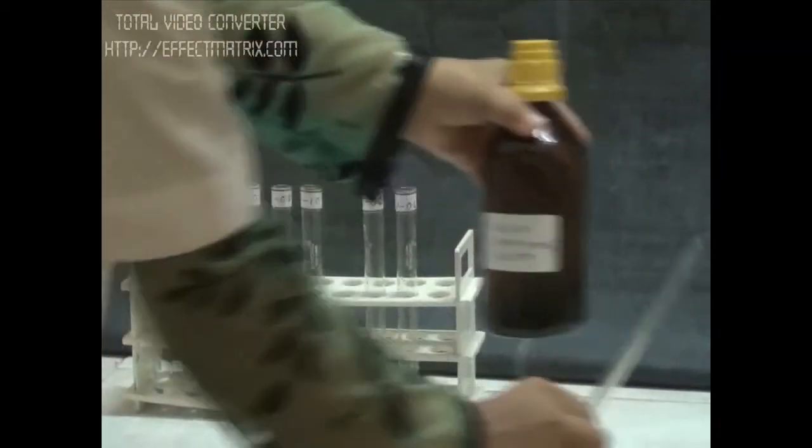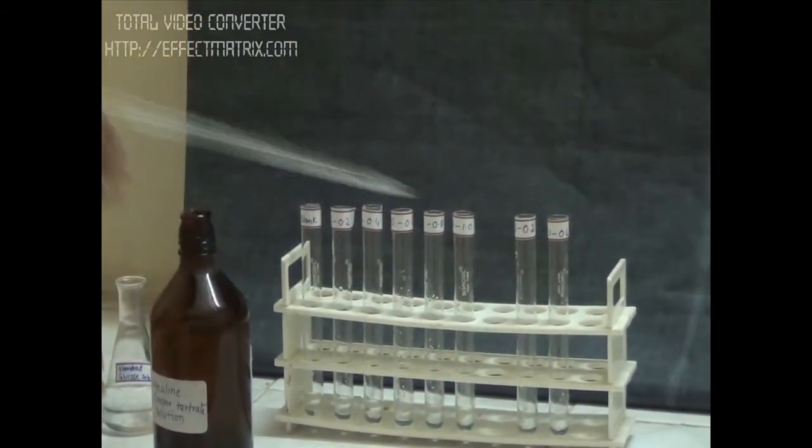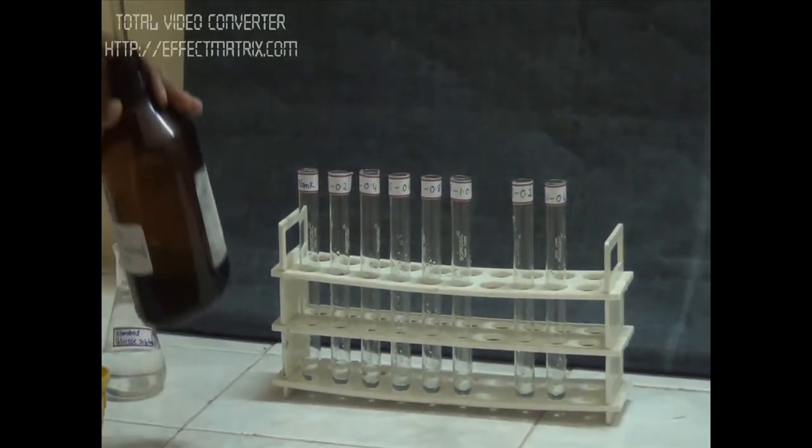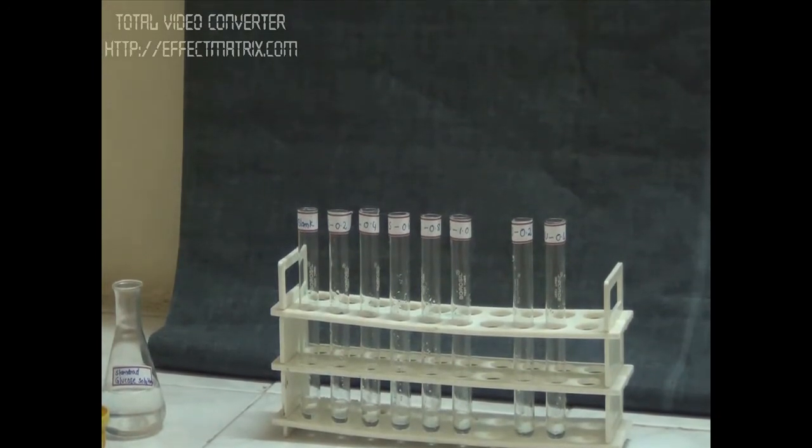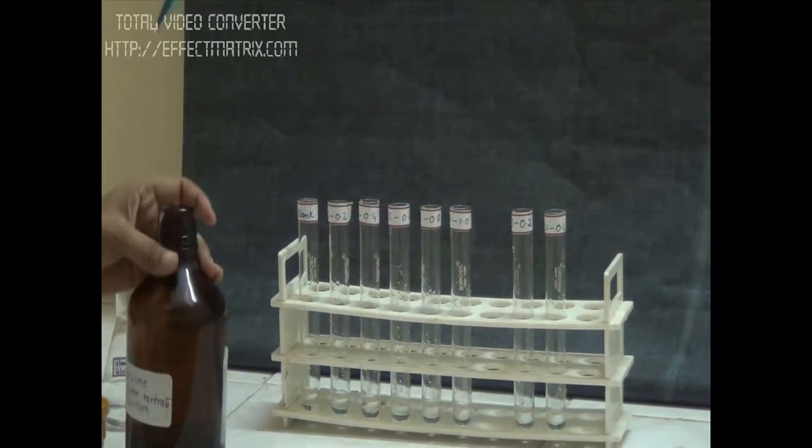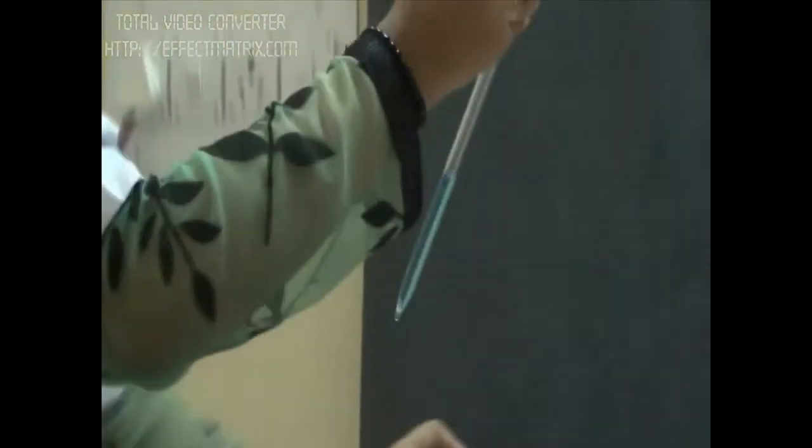Now we have to add our reagent, alkaline copper tartrate solution. What it does is our copper tartrate solution has cupric ions in it. This cupric ion is going to react with our reducing sugar, and our reducing sugar is going to reduce it to cuprous oxide. We have to add 2 ml of cupric copper tartrate to every tube, so it will convert our cupric ions to cuprous oxide.